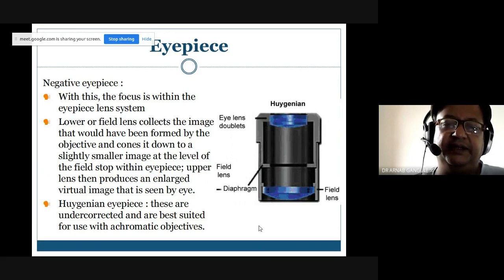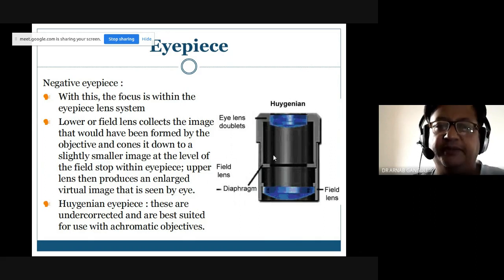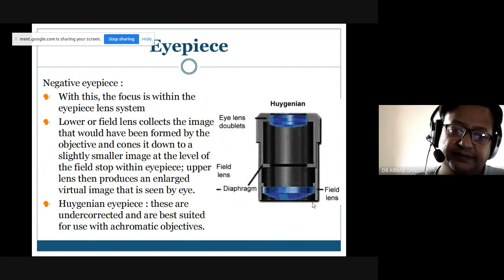ভেতর দিকে ঢুকিয়ে দেবে. এখানে লাইট এলে সোজা চলে যাবে, কিন্তু বাইরে থেকে লাইট যদি আসে এটাকে সোজা করে দেবে টুয়ার্ডস দ্য নর্মাল. লাইট গুলো ফোকাসটা এখানে পড়বে.